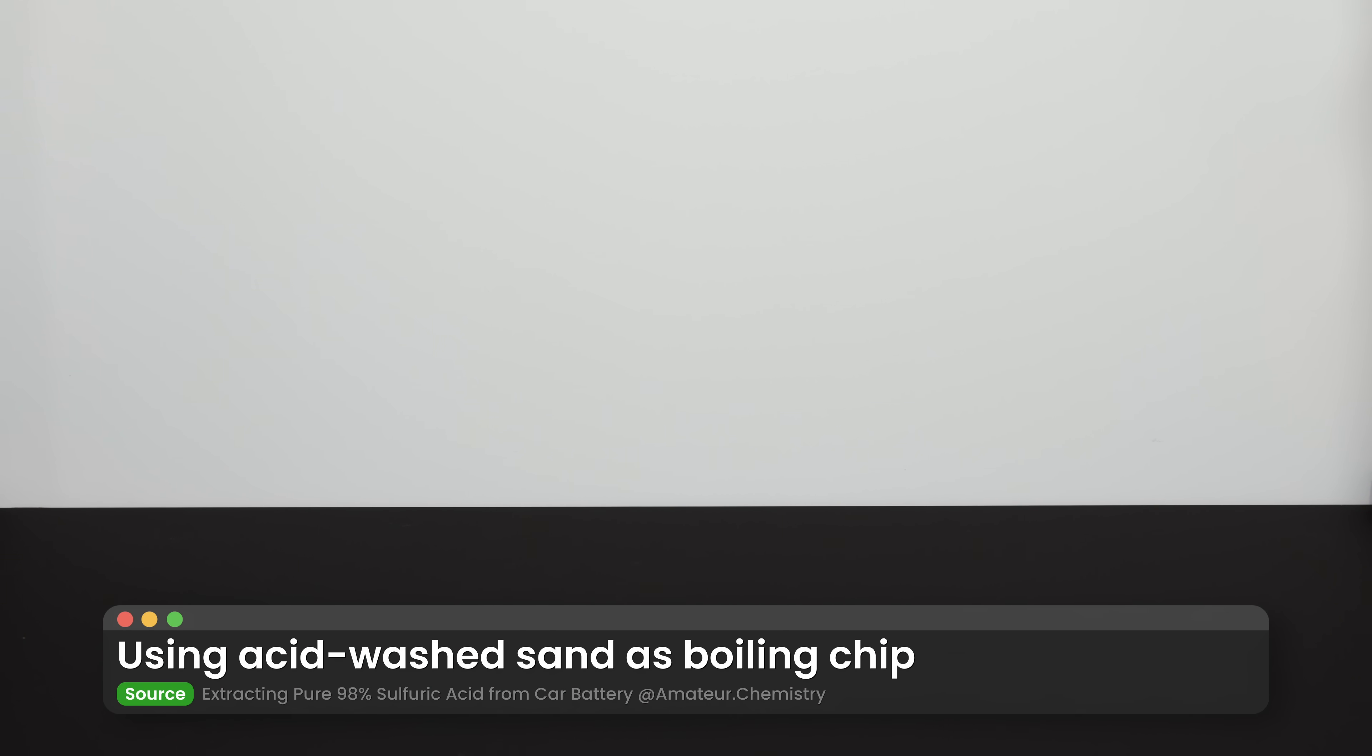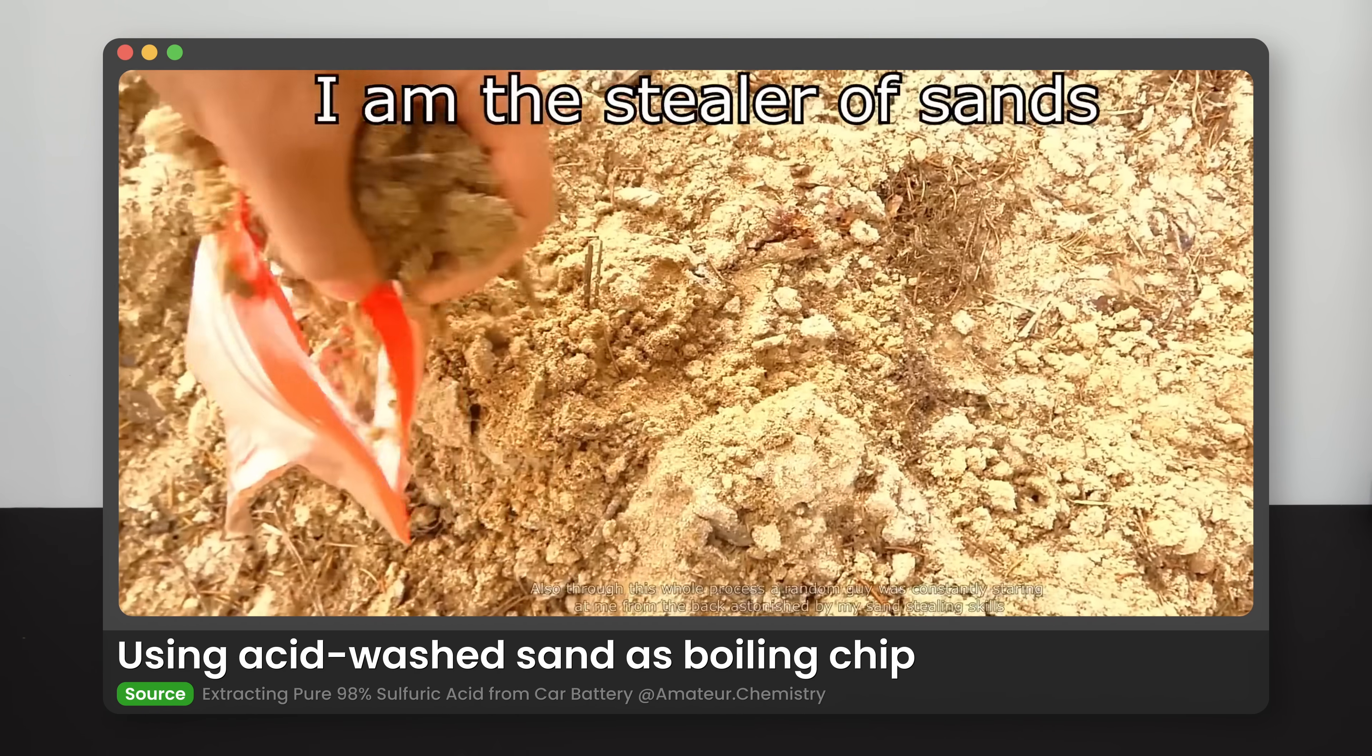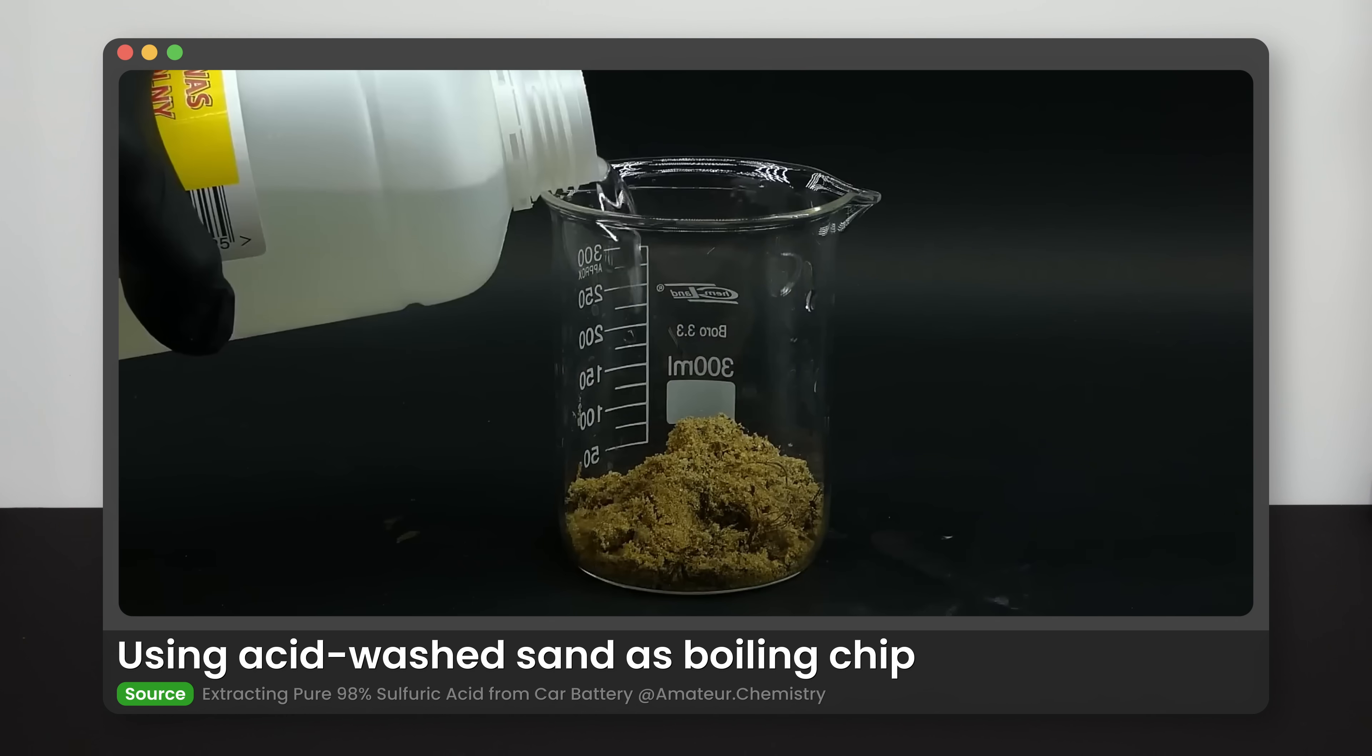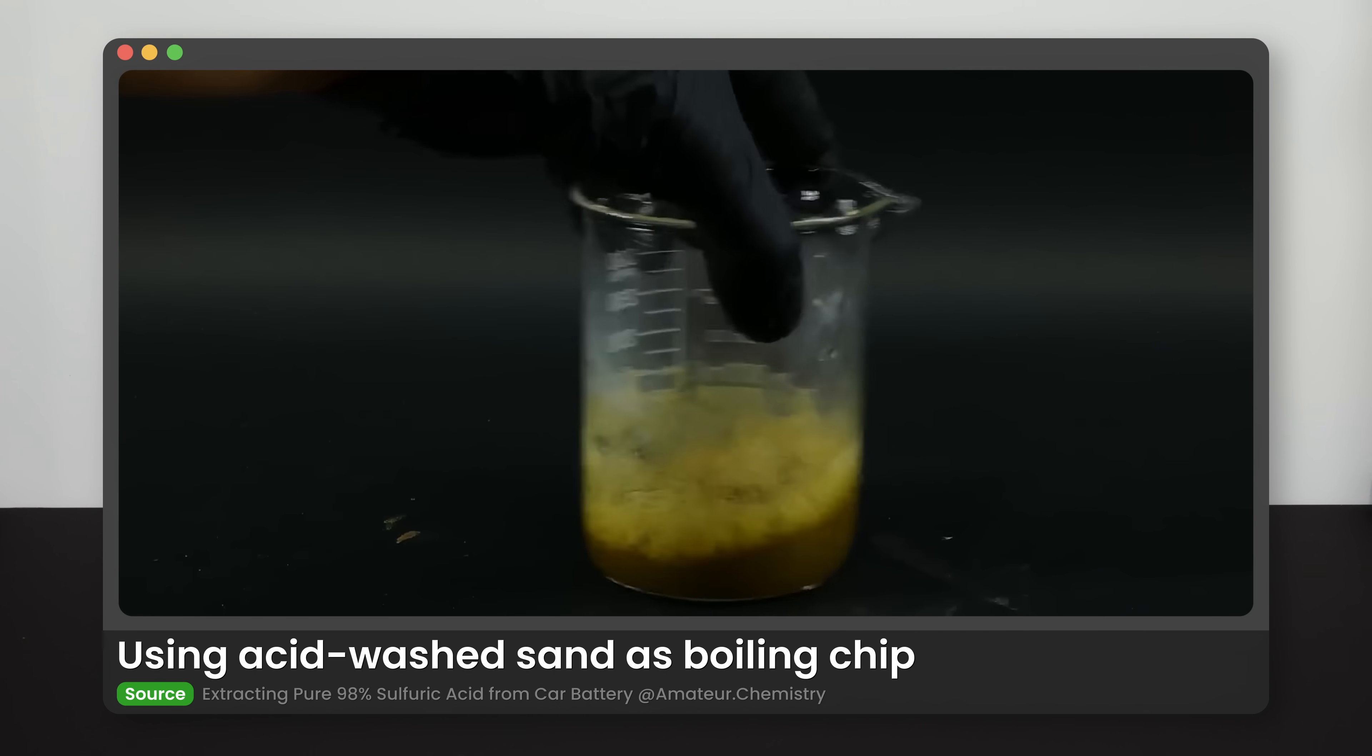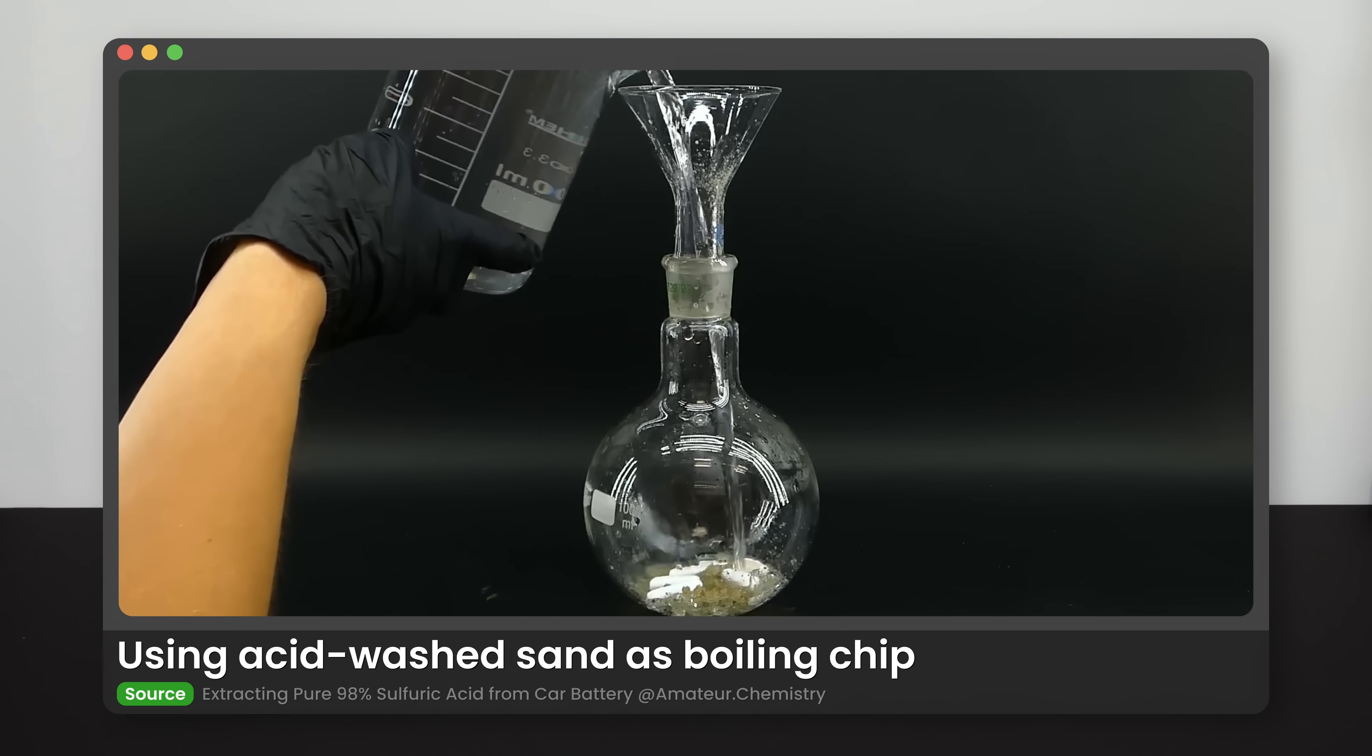The last one is sand. It works similarly to broken clay pots but to a lesser extent. And somehow it will also slowly scratch the glass and leave some marks just like clay pots. So I would recommend using clay pots over sand.